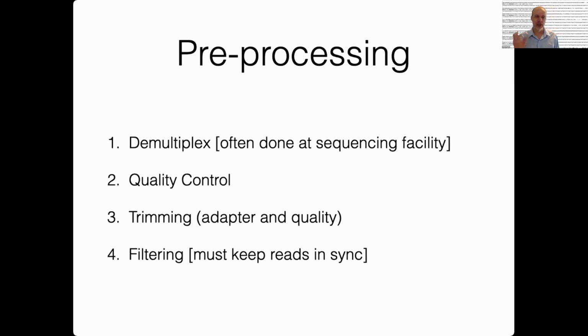But that summary information is fairly general for all high throughput sequencing data. There can be some things specific to RNA-seq that you expect differently than, say, DNA-seq. And that does sometimes inform our trimming and filtering.